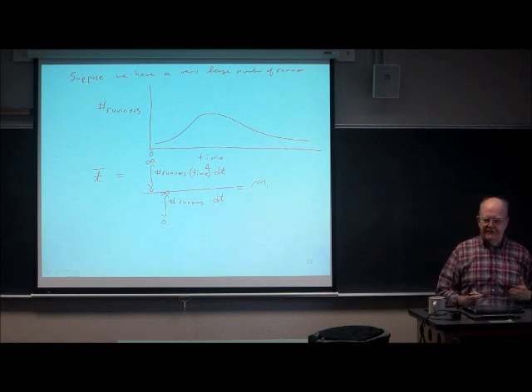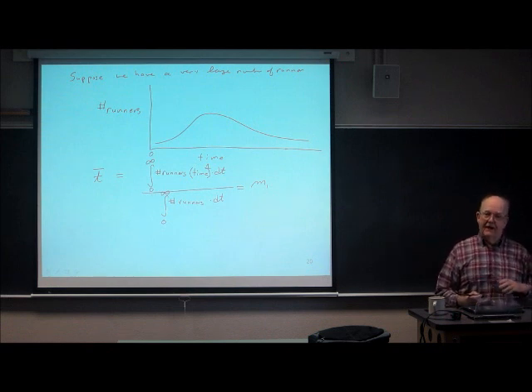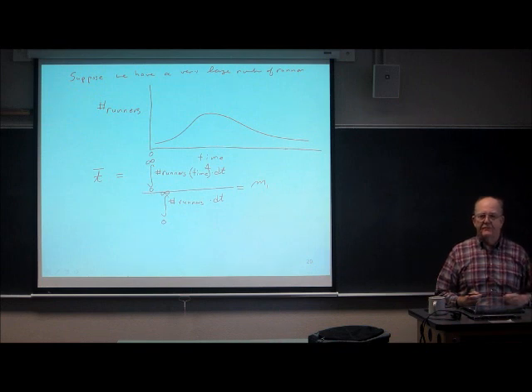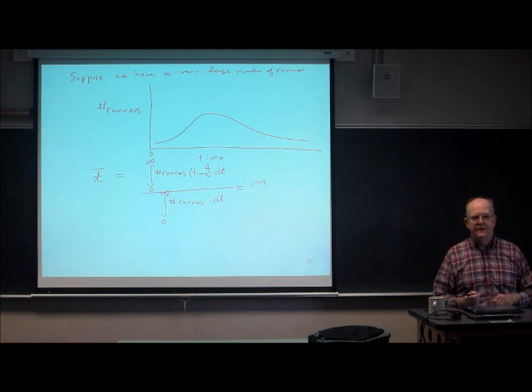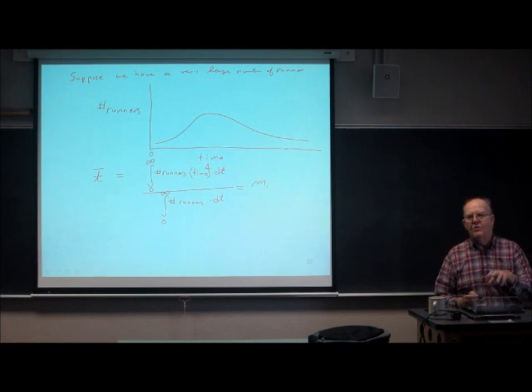And we represent the stuff coming out of the end of the column as a continuous distribution, except when we got a plate model and we got small numbers of plates, then we have to deal with a discontinuous distribution, and the integral wouldn't work so well. You'd have to do the actual calculation, which is what we did back when we were playing with the plate model. So that's what moments are all about.